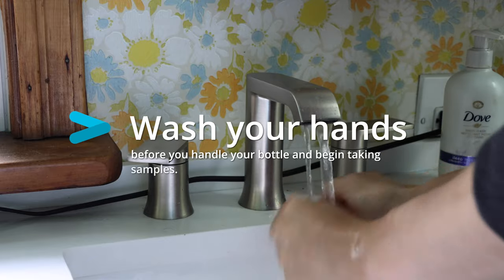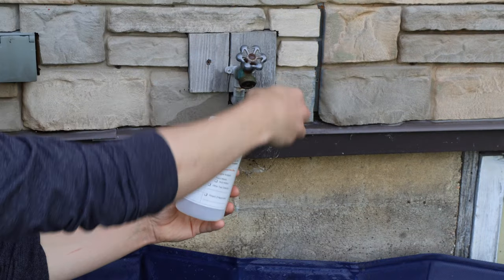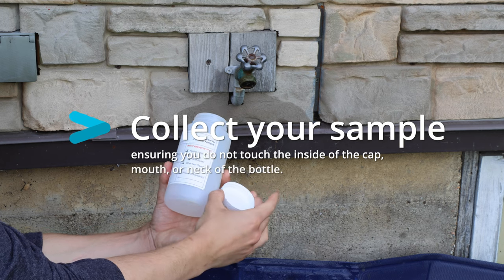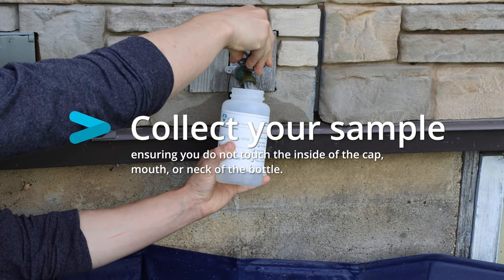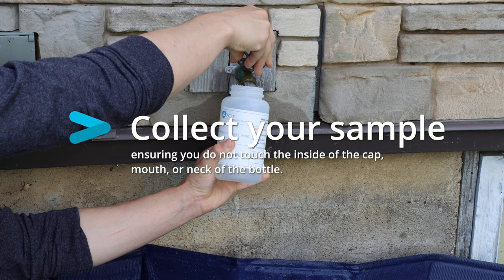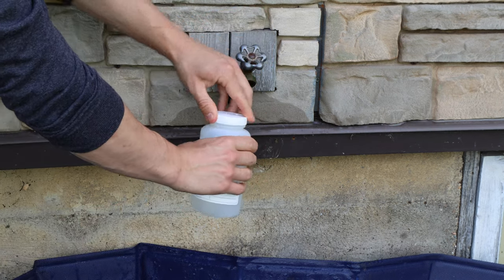I'm going to wash my hands before touching my bottle. Making sure not to touch the mouth or inner rim of my bottle, I can collect the water sample and immediately seal my bottle back up. To ensure the quality of my results, it's important not to give any external potential contaminants the chance to get inside the bottle.